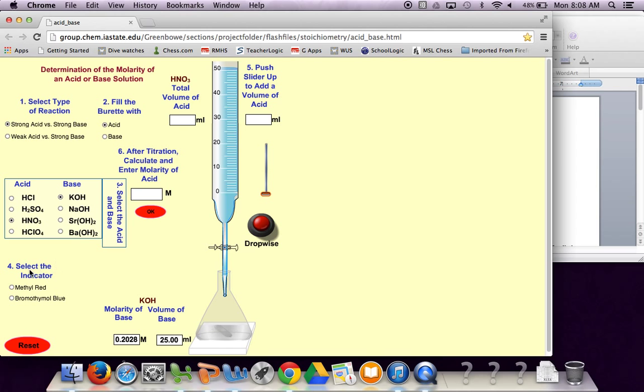We're going to select our indicator which is bromothymol blue. So the acid is in your burette and the base is down here. Bromothymol blue in the presence of a base will be blue in color.